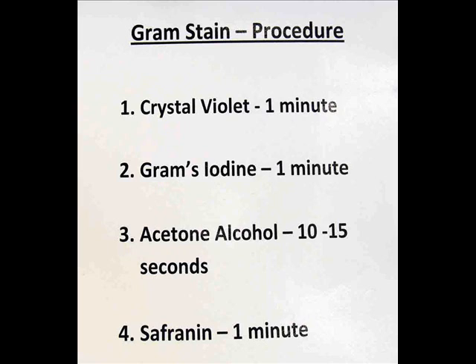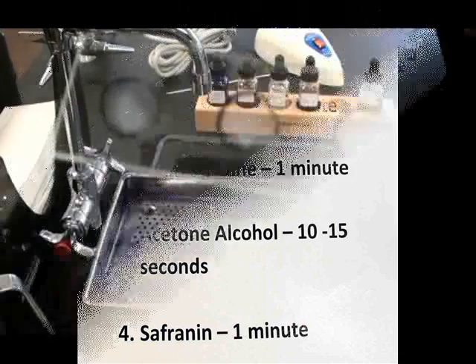I run that over the slide for 10 to 15 seconds and then rinse. My last step is to apply Safranin. This is a pink stain that will stain the Gram negative bacteria. It is my counter stain.